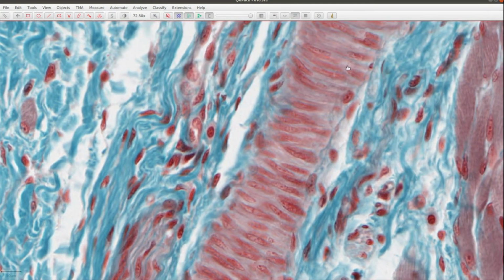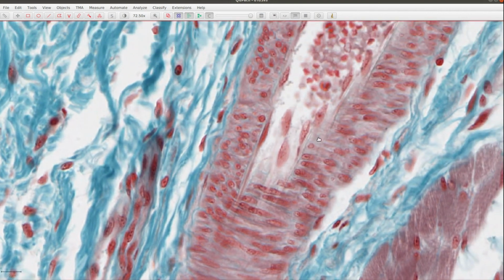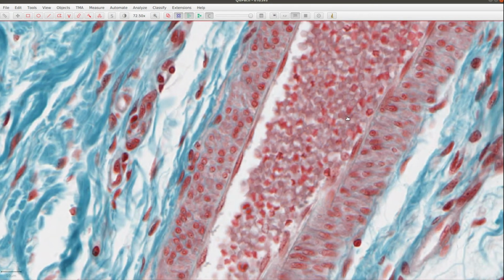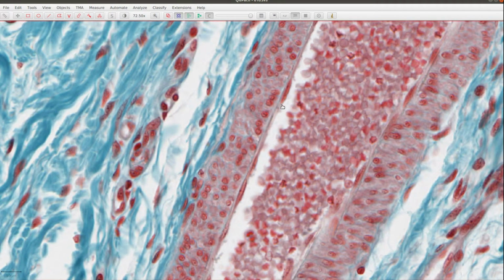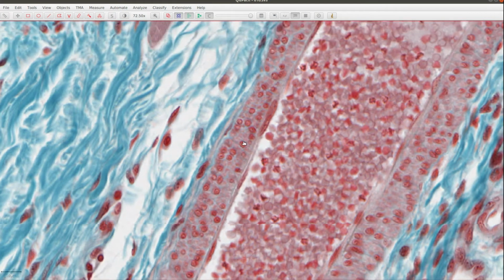And if you don't believe me that it's a blood vessel, if we follow it up, eventually we enter the lumen as it just changes plane of section, and we can see that it's a lovely blood vessel with red blood cells in the lumen, lovely endothelial cells in the tunica intima. You can really appreciate them there. And then some smooth muscle but cut in a different section. So rather than having longitudinal sections of the nuclei giving the nice sausage shape, they've been cut through the middle. So we've got round nuclei instead.